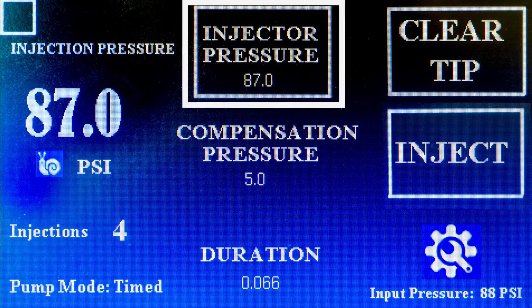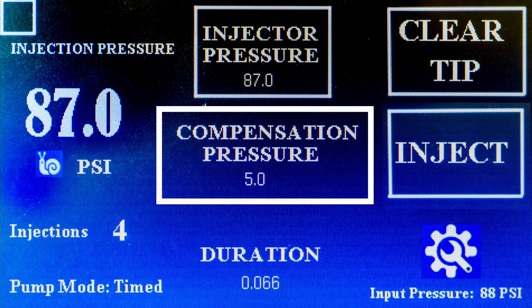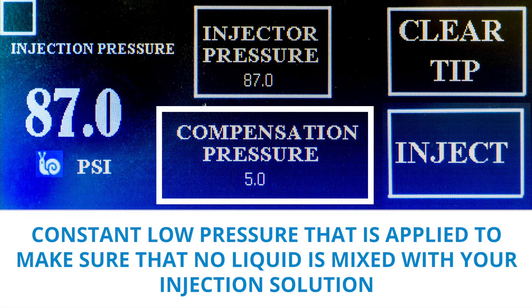The injector pressure indicates the maximum pressure that will be used when the pressure is activated. The maximum that can be used is 87 psi. The compensation pressure indicates the constant low pressure that is applied to make sure that no liquid is mixed with your injection solution.